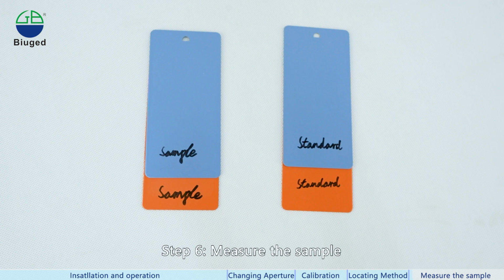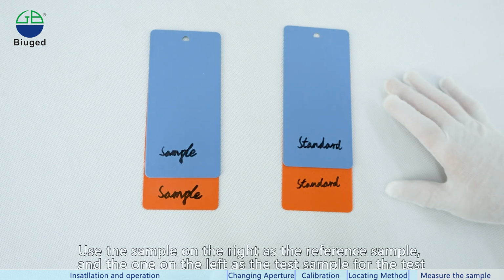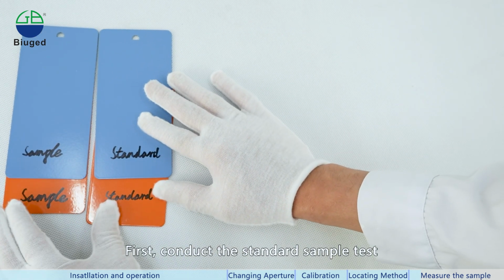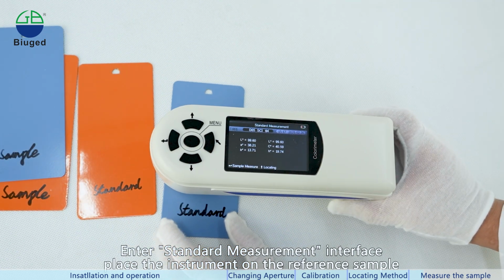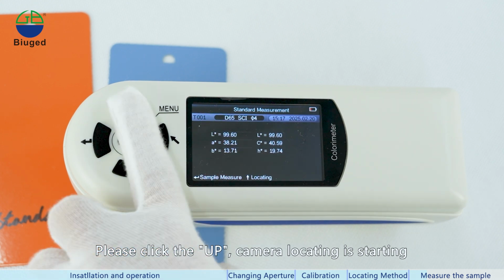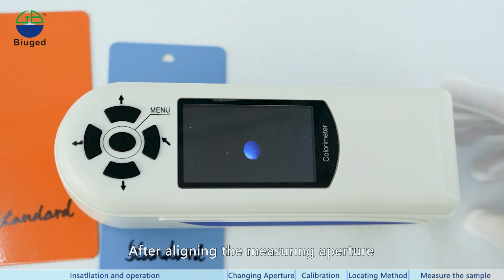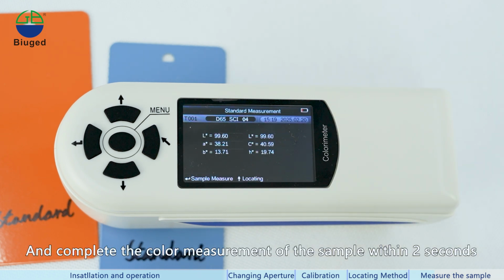Step 6. Measure the sample. Use the sample on the right as the reference sample, and the one on the left as the test sample for the test. First, conduct the standard sample test. Enter the standard measurement interface. Place the instrument on the reference sample. Please click the up button. Camera locating is starting. After aligning the measuring aperture, press the testing key and complete the color measurement of the sample within 2 seconds.